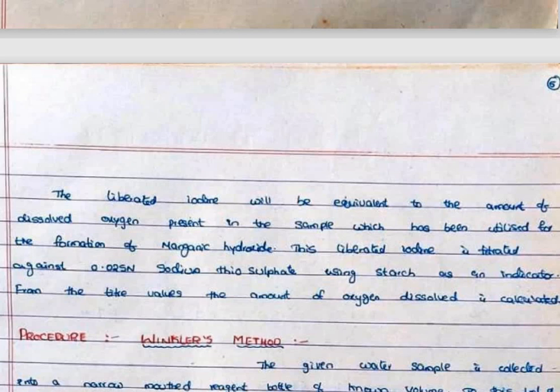This liberated iodine is titrated against 0.025 N sodium thiosulfate (hypo) solution using starch as an indicator.